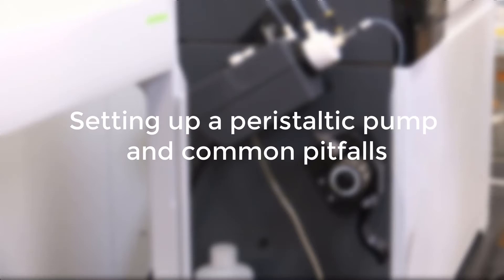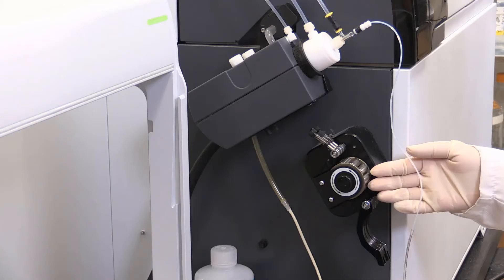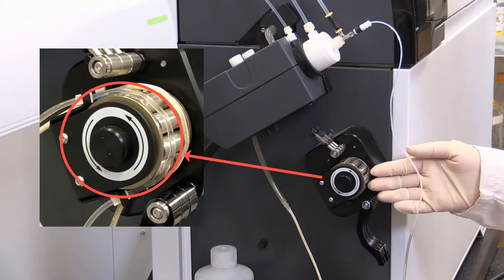Here is the setup and common pitfalls. Most peristaltic pumps will have arrows indicating the direction of the tubing. In this case, tubing should be clamped counter-clockwise.